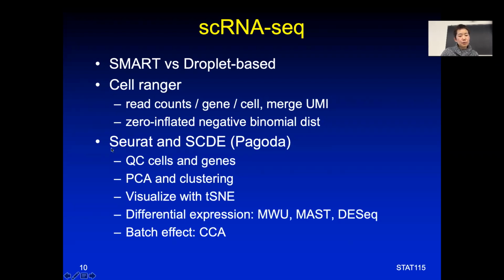And in order to really do the differential expression test, we're going to use Seurat, which I introduce in the homework. And SCDE was developed by Peter Kharchenko's group at Harvard. Their original algorithm is called SCDE. I think now it's called Pagoda. The second one has more of a point-and-click kind of user interface, which is very friendly to experimental biologists. And Seurat is more script-based.